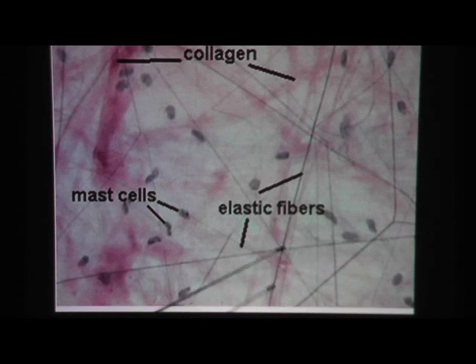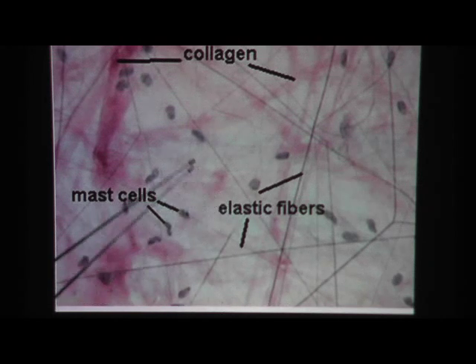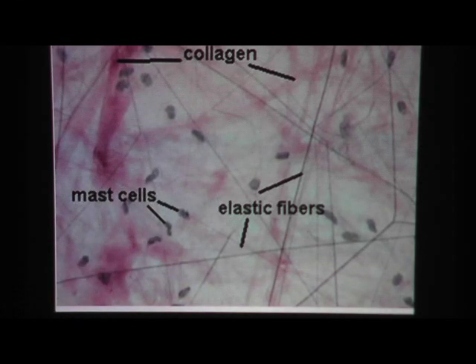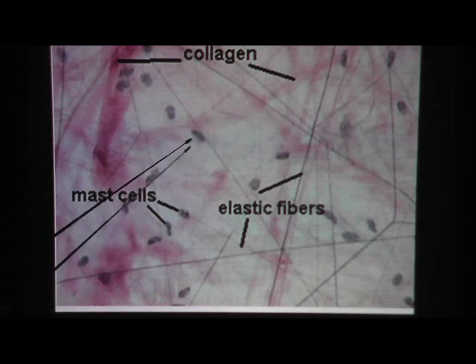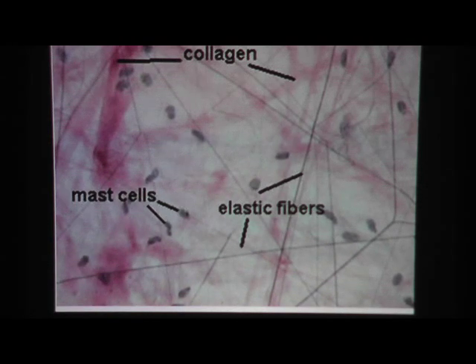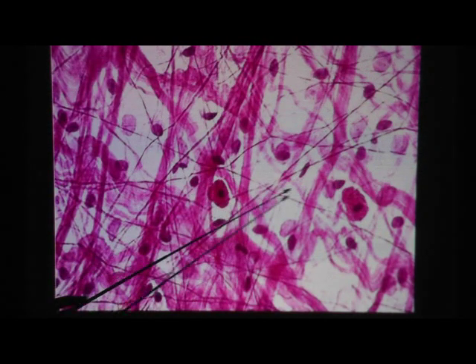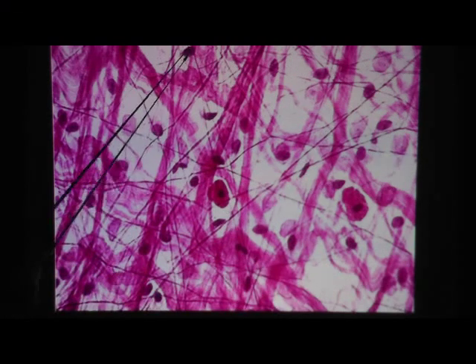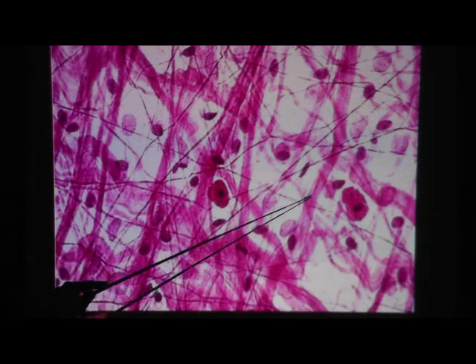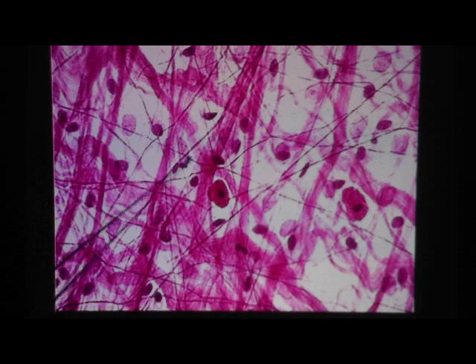Here's another view of areolar connective tissue. This labels a mast cell, but what we're really focused on remembering is fibroblasts. You can see thick collagen fibers coming through and thin elastic fibers. In another view, you can clearly see the collagen fibers, the thin elastic fibers, and the fibroblast nuclei as little dots. The bigger dots are probably white blood cells. The thick band is collagen fiber; the thin dark lines are elastic fibers.